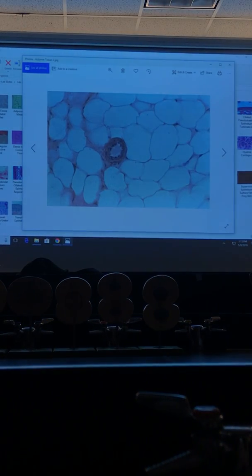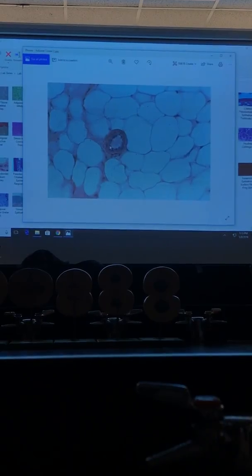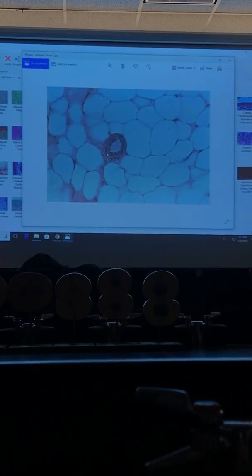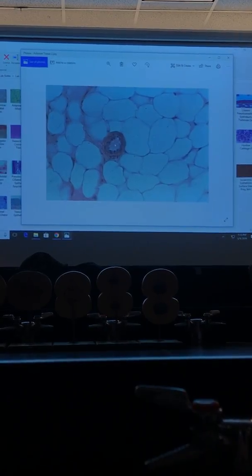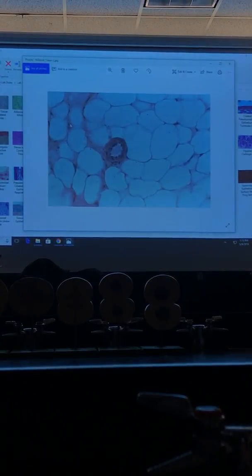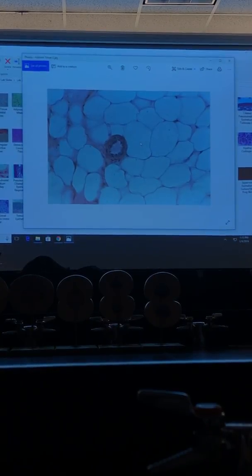That's a gorgeous slide. This shows you a blood vessel, and although I don't ask you, this is elastic tissue and smooth muscle, and then some DICT out here. This is her arterial structure. But what you got to know now, adipose loose connective tissue, adipocyte.